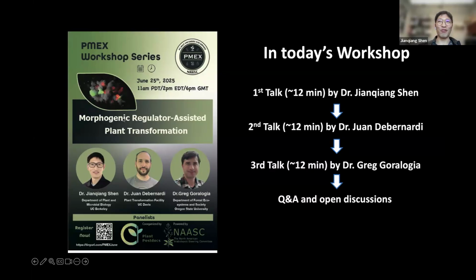For sorghum, with the morphogenic gene you can get a shoot regenerated immediately, but without it, it will stay at the callus or immature embryo status for a long time. So using the morphogenic gene is a good way to filter out the chimerism of the transformation.